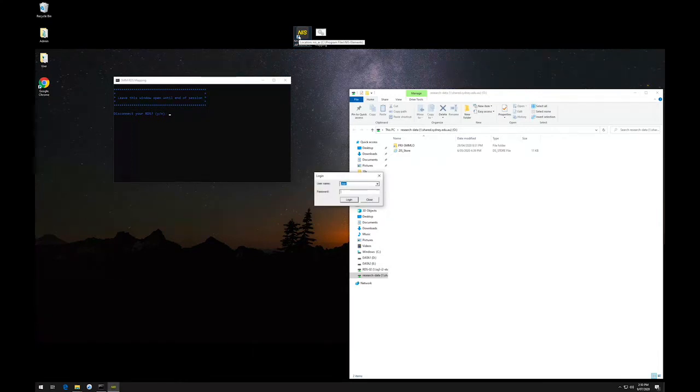Now open the NIS Elements software. Log in as user. If you have forgotten the password, it is written in the manual located on the desk.